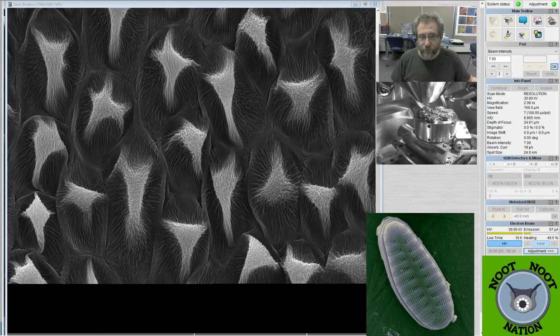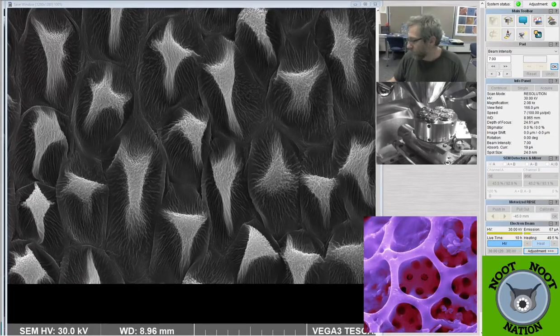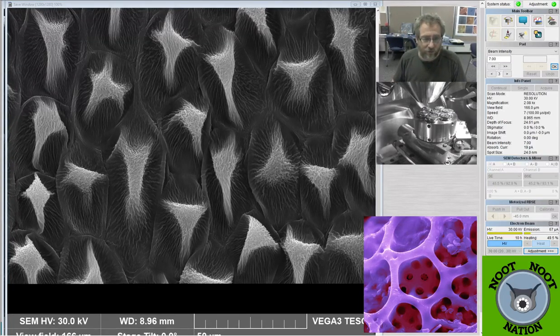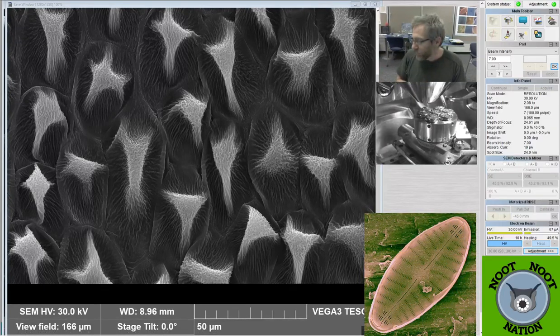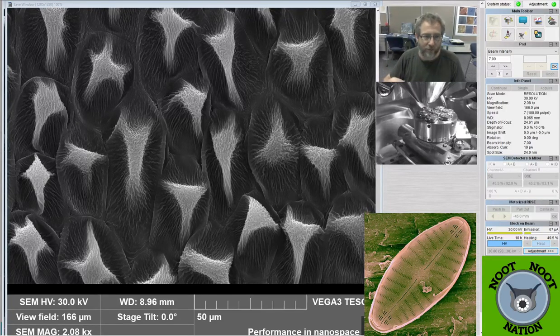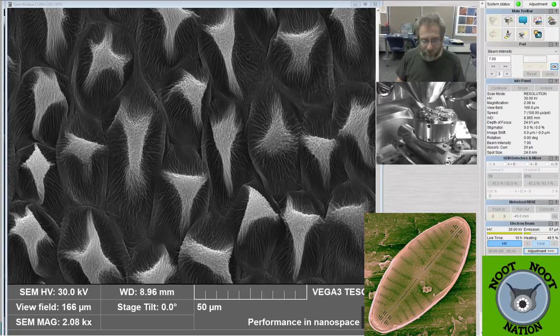And then I stuffed it in the SEM. That's it, so almost no prep. I started this morning at about 11, about 2 hours ago, collecting some pollen. And then when I got to campus, I wandered around here and collected some more stuff, and actually was able to collect more plants than I could put into the SEM easily. So I can only put 7 at a time, so I kind of had to pick which ones I wanted.